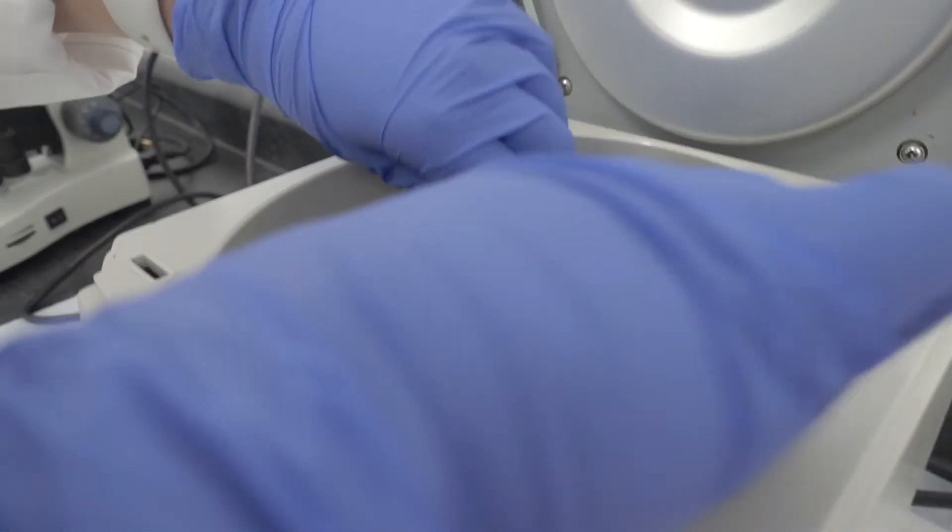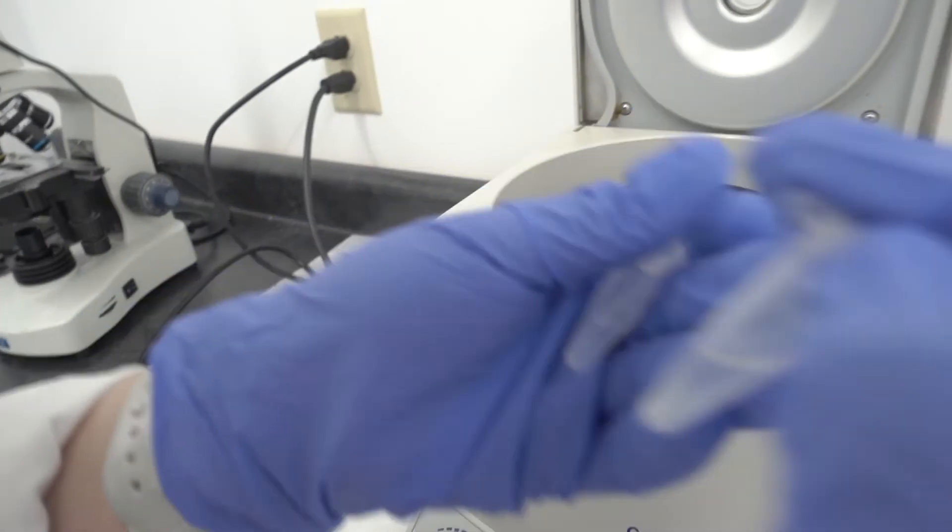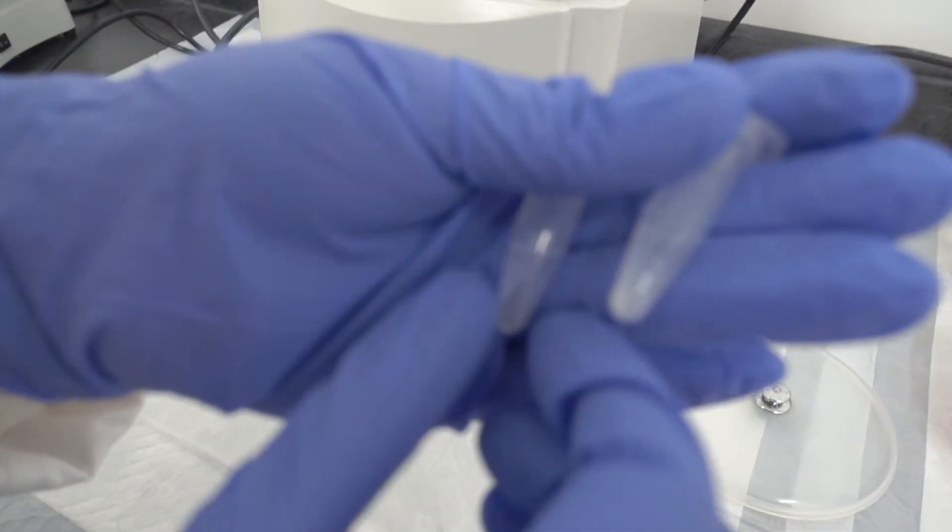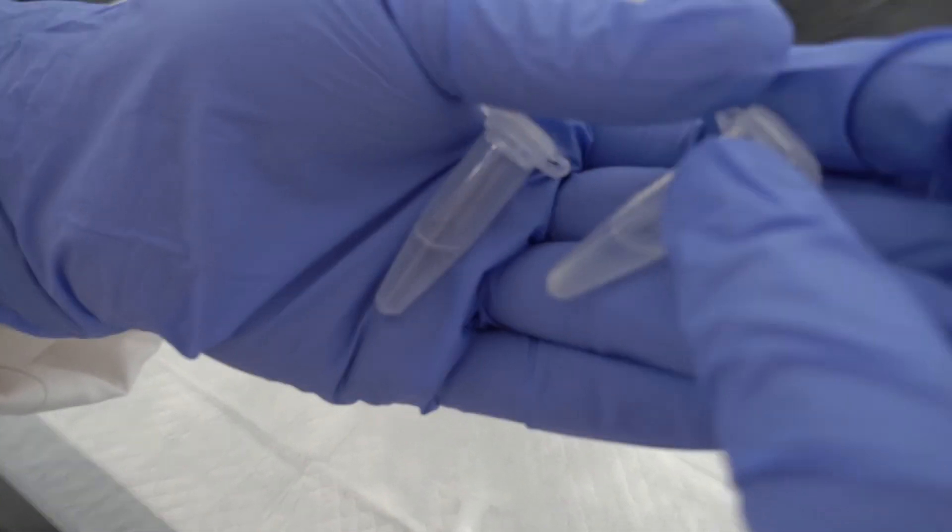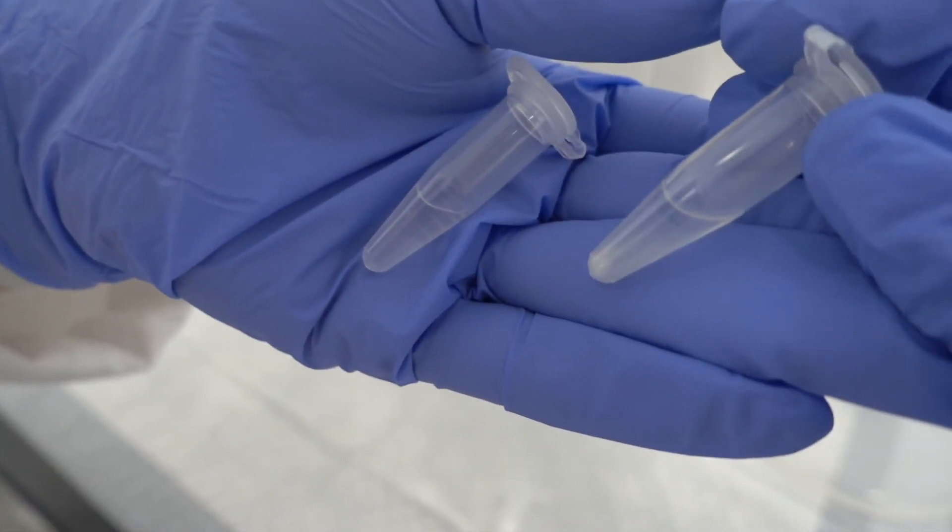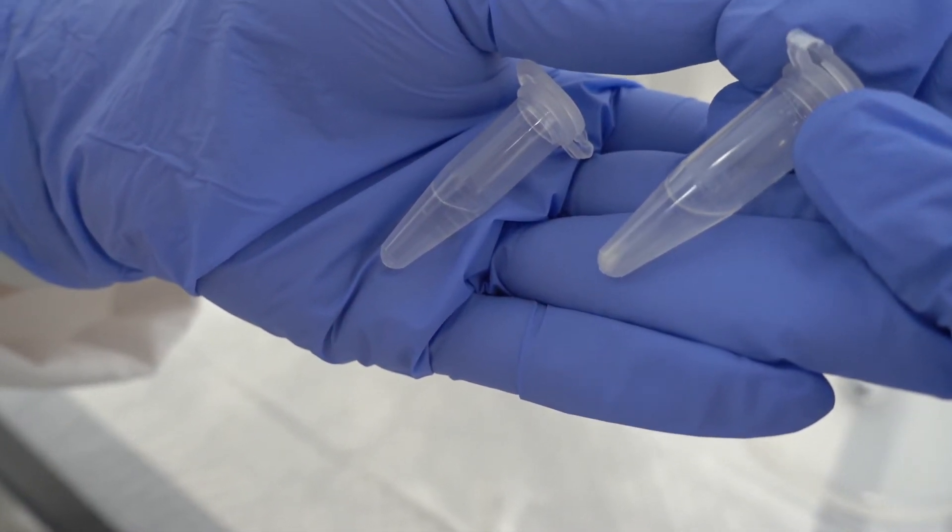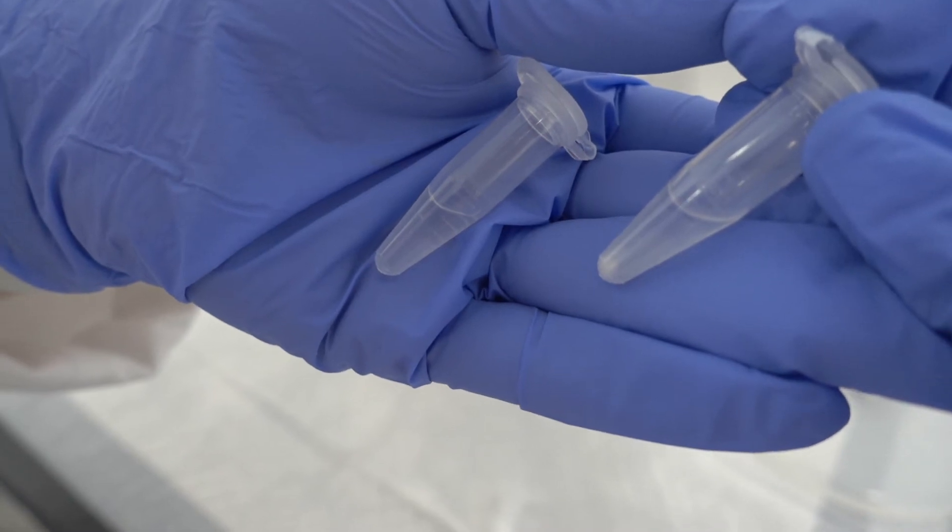Now we've centrifuged the samples and you can clearly see that the MINUTE sample is completely clear, whereas the RIPA sample has a pellet that's formed, indicating that there has been non-systematic protein loss.